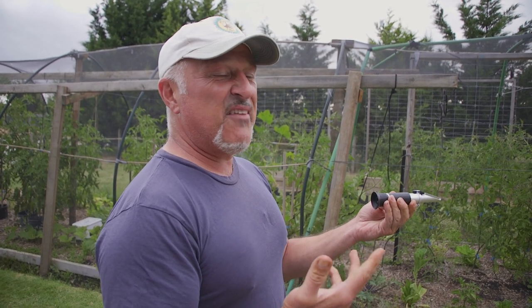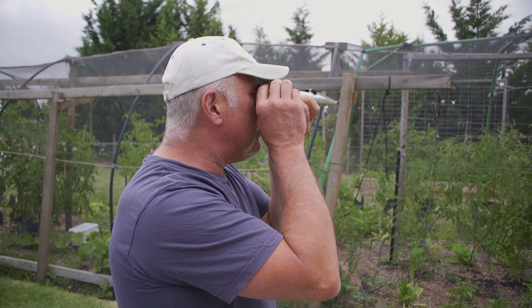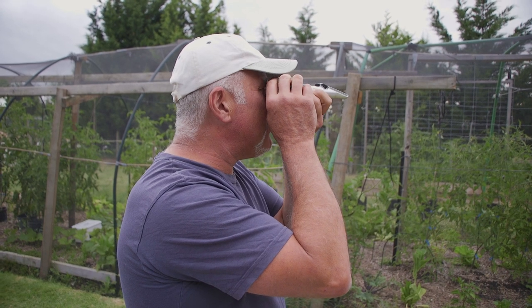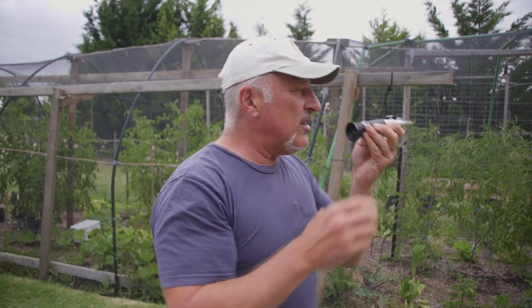So we had a nine reading. I'd expect it to jump up to ten, eleven, twelve if I'm lucky after twenty minutes. It's sitting at ten now, so it's gone up one notch.